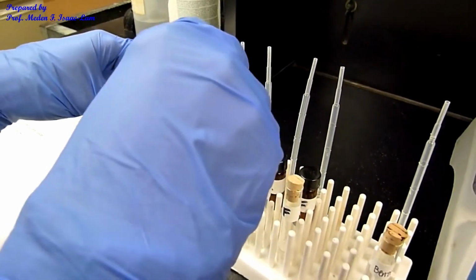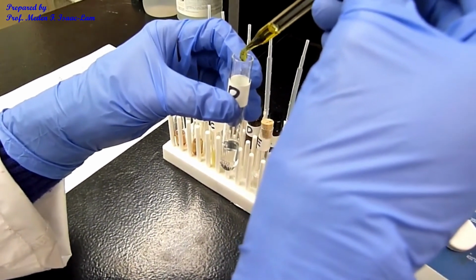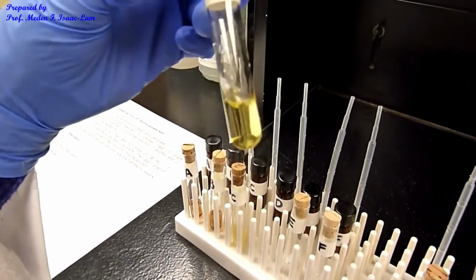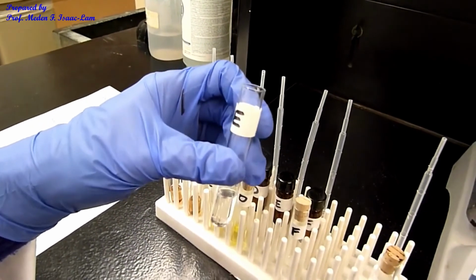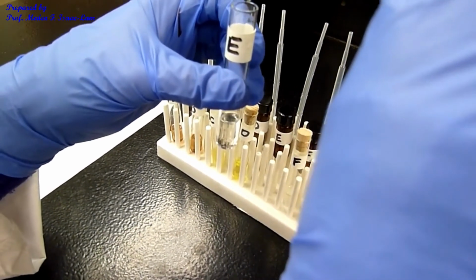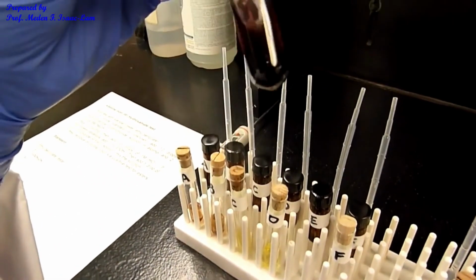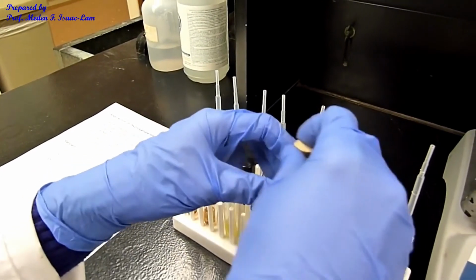And then D. So yellowish, nothing. And then now E. So E turned purple, reddish purple color. So that's E. And then F.